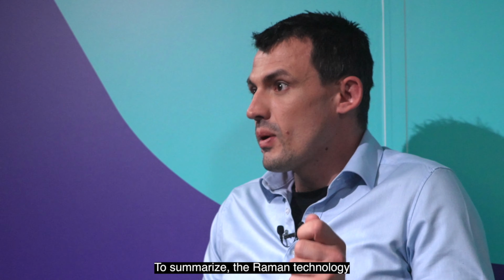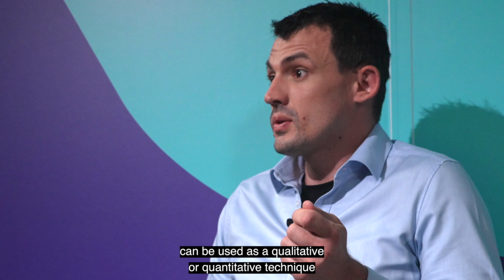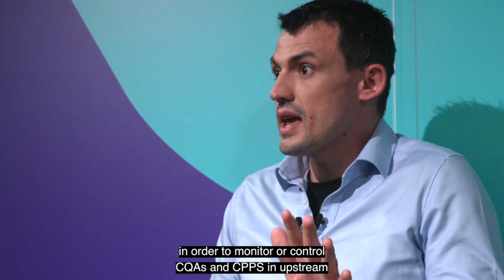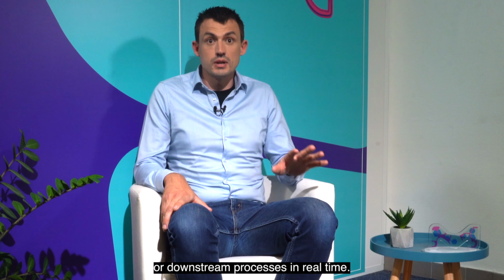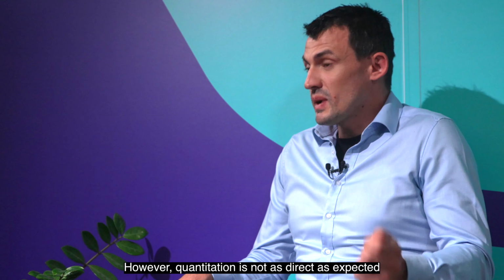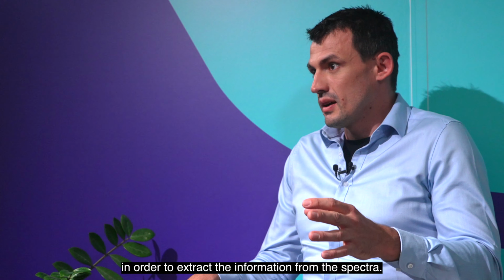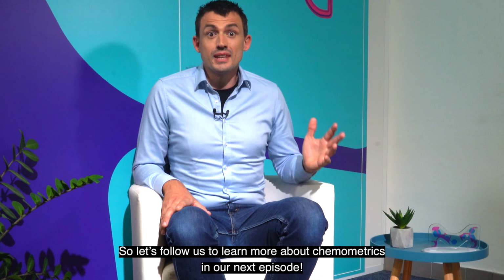To summarize, Raman technology can be used as a qualitative or quantitative technique in order to monitor or control CQAs and CPPs in upstream or downstream processes in real time. However, quantitation is not as direct as expected and requires a chemometric approach in order to extract the information from the spectrum. So let's follow us to learn more about chemometrics in our next episode.